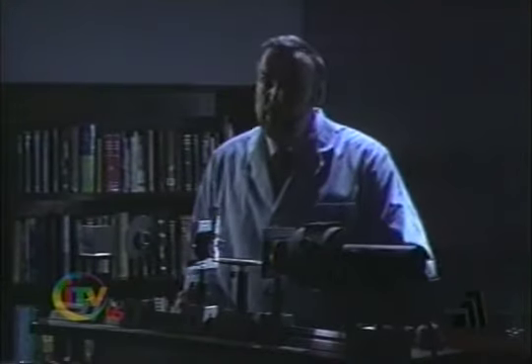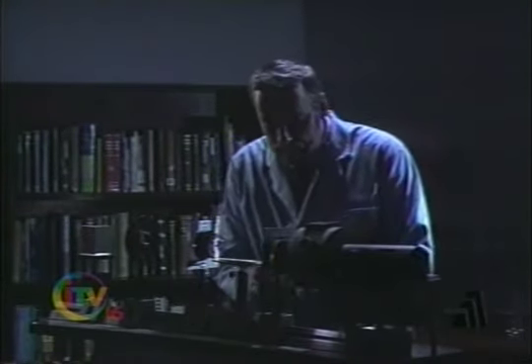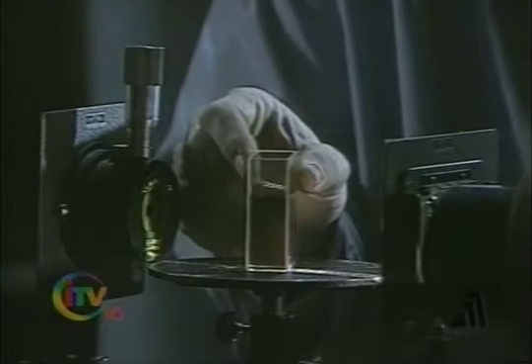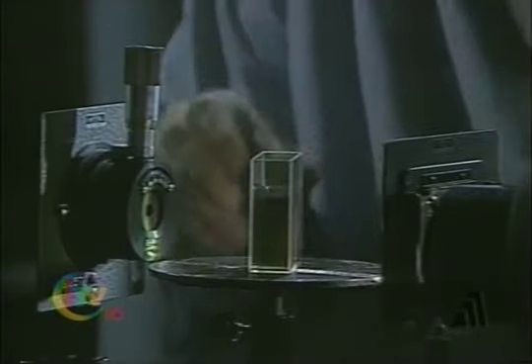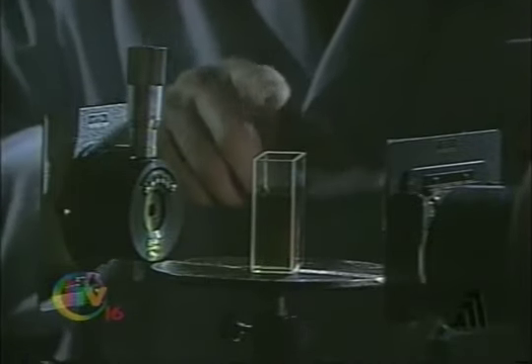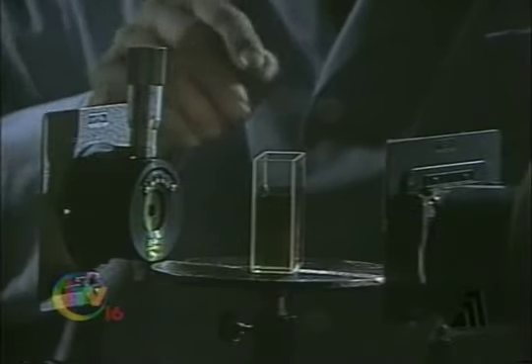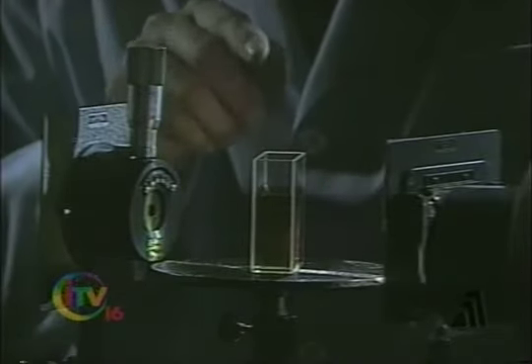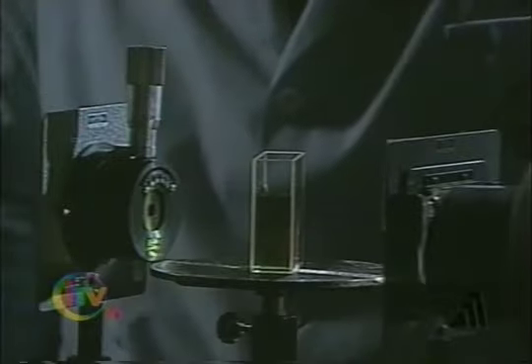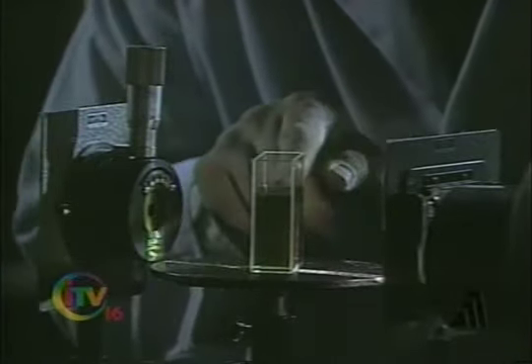Now, what would happen if we put a sample in there? The sample that we're going to examine is chlorophyll. I mixed some grass with alcohol and chopped it up in a blender. The alcohol extracted the chlorophyll from the grass. And look what happens when the light passes through the chlorophyll sample. A band of light is removed.